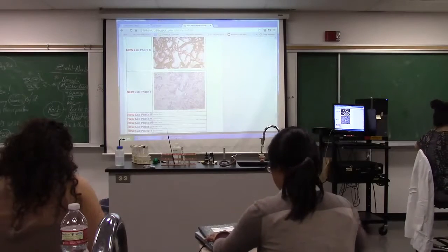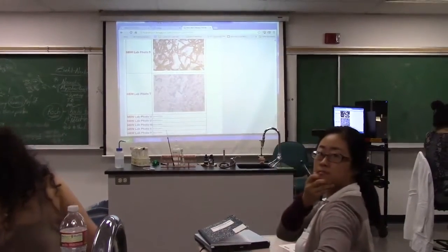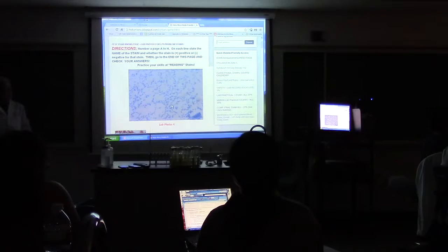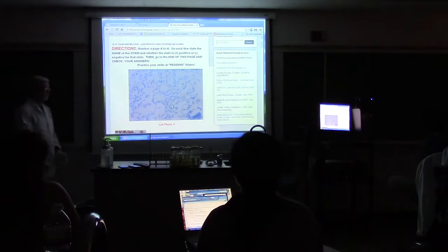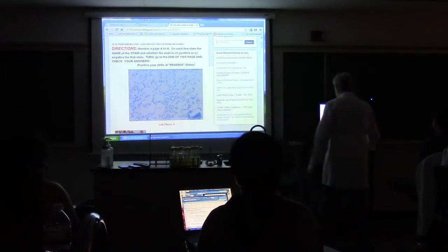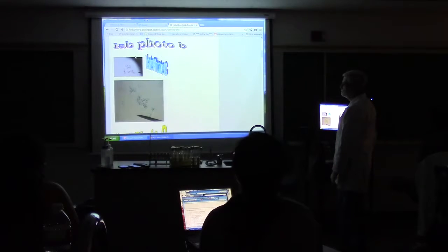Excuse me. Stop the video, right? What? Oh yeah, that one. Is that green? It's not endospore. Is there pink? No. So it can't be gram and it can't be endospore. So what's it got to be? Acid-fast, because there's only 3. All right, if you looked at the next one, that one would be pink, and there are little pieces of garbage green here, so this you know was endospore.